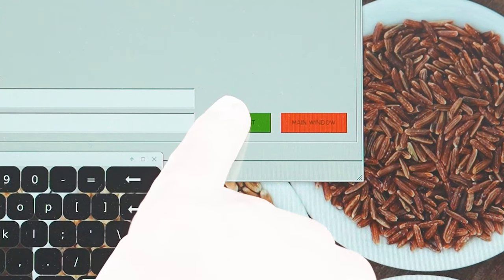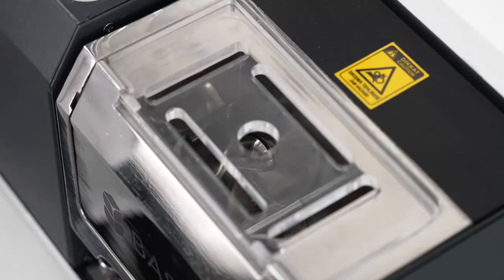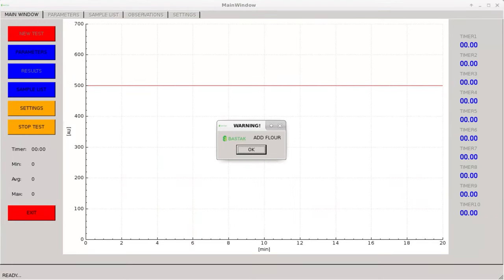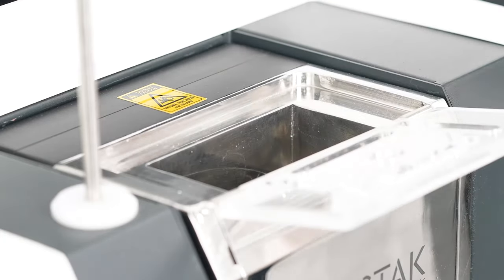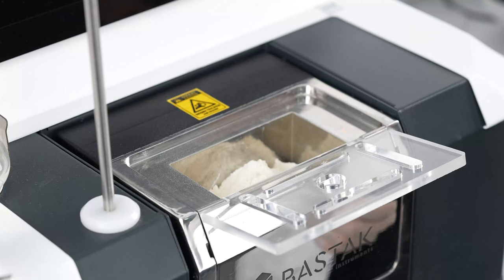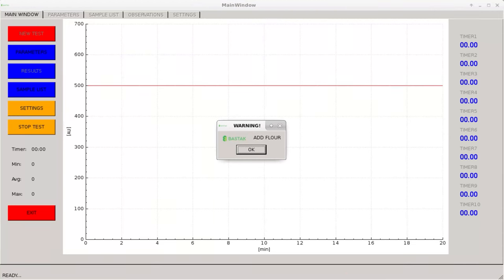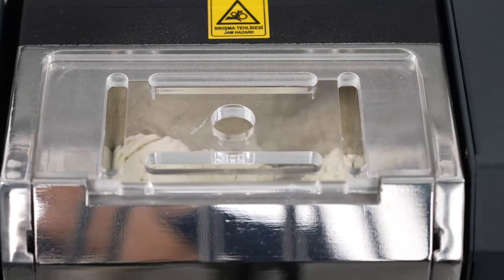The start test indicator is pressed and the engine of the device starts to work. The add flour warning appears, the plexiglass cover of the kneading unit is carefully opened, and the flour sample is poured into the sample container. The plexiglass cover is carefully closed and OK is pressed on the touch screen. The kneading blades mix the sample for 45 seconds for homogenization.